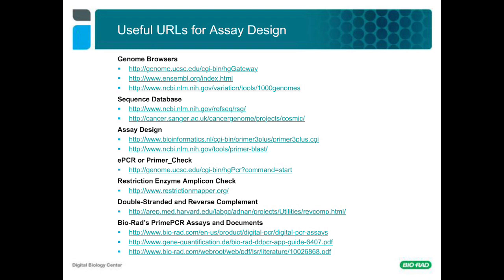And then regarding FFPE samples, you mentioned that Bio-Rad sells wet lab validated assays. Have these assays been used on FFPE samples? Yes, we've actually run panels of our assays on FFPE samples, and so they have all been tested on FFPEs.